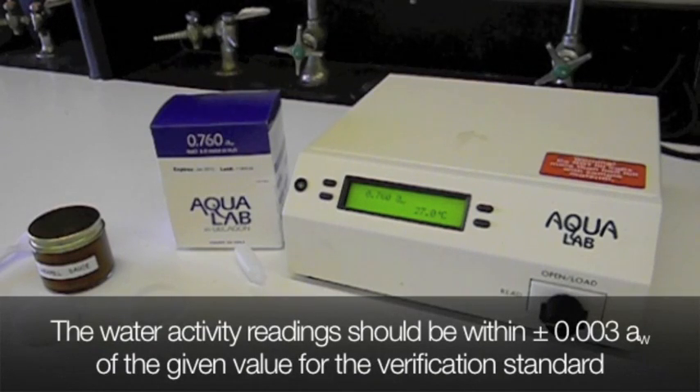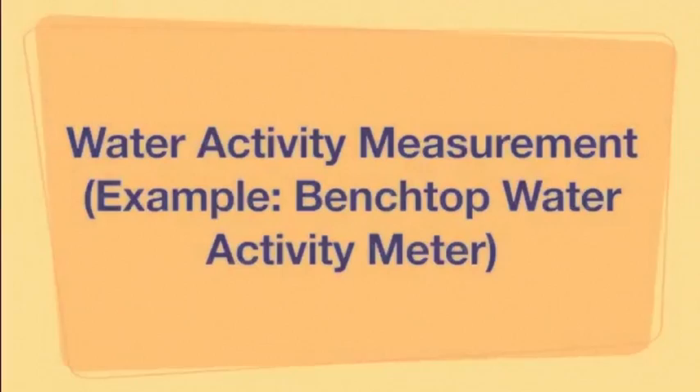The water activity readings should be within 0.003 of the given value for the verification standard.